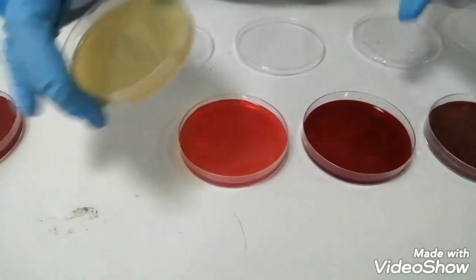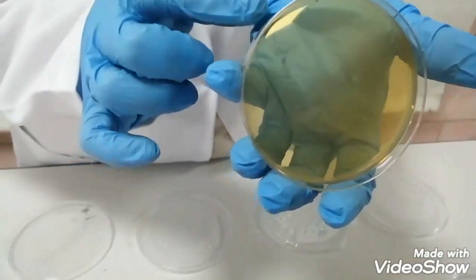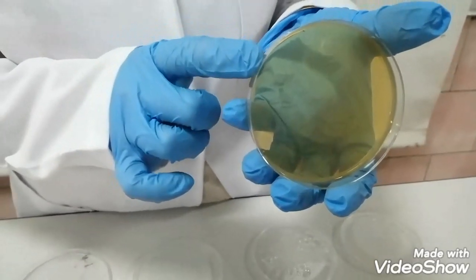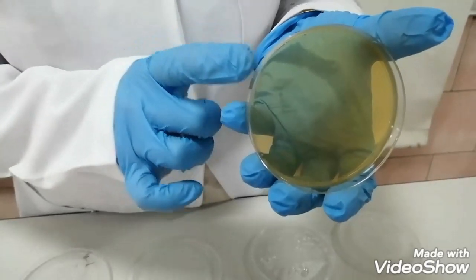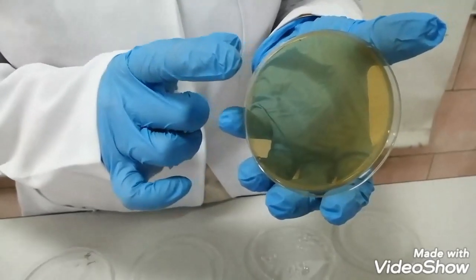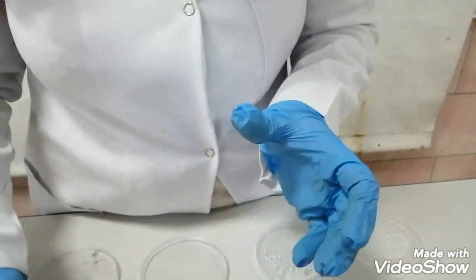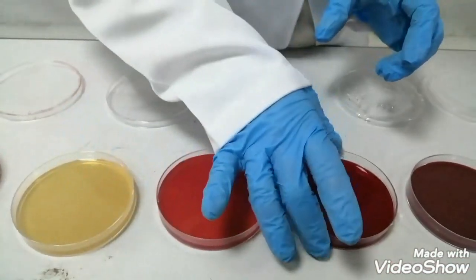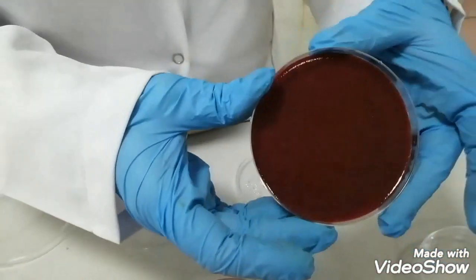Starting with the nutrient agar, it is the simplest one, and it is used for cultivation of most microorganisms. Its main ingredients are peptone, water, beef extract, and sodium chloride, together with the agar-agar substance. This is the nutrient agar. We have other examples, such as blood agar and chocolate agar, for the solid media.